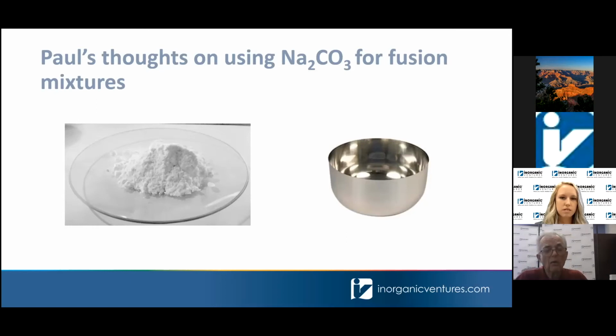However, for the inexperienced analyst, they can be problematic. Too much peroxide with too much organic, or even nitrates with too much organic, heated too quickly can lead to problems. We use and recommend the use of sodium carbonate. It's a very safe reagent.